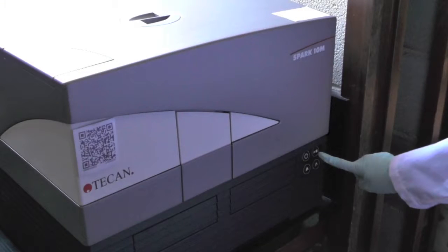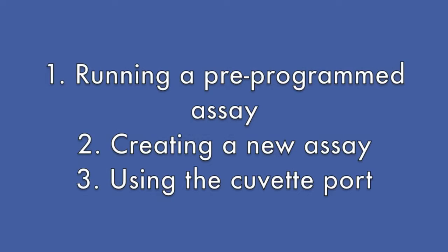This video will demonstrate the standard operating procedure for the T-CAN spectrophotometer. By the end of this video, you will be able to perform a quick test of your samples using a pre-programmed assay, set up a routine assay specific to your research need, and use the cuvette port for quick reading.